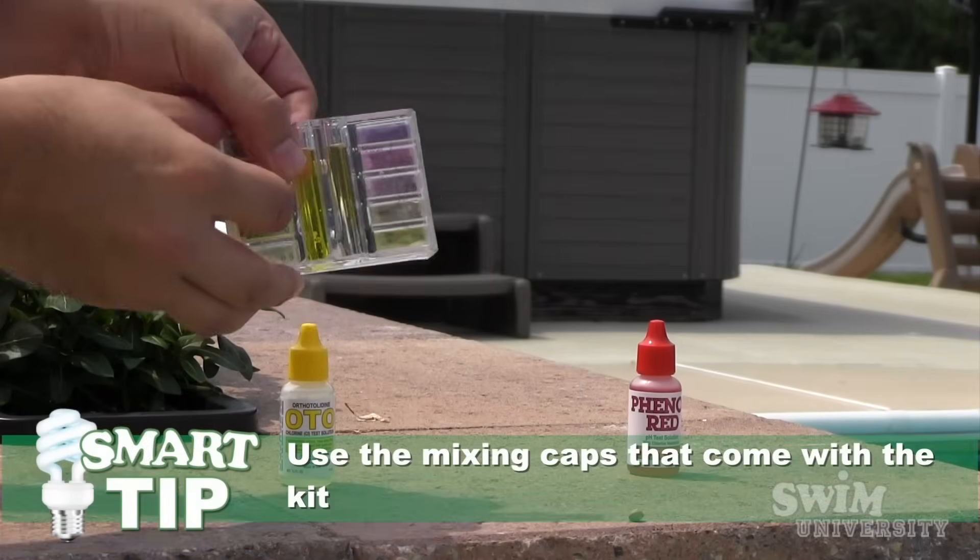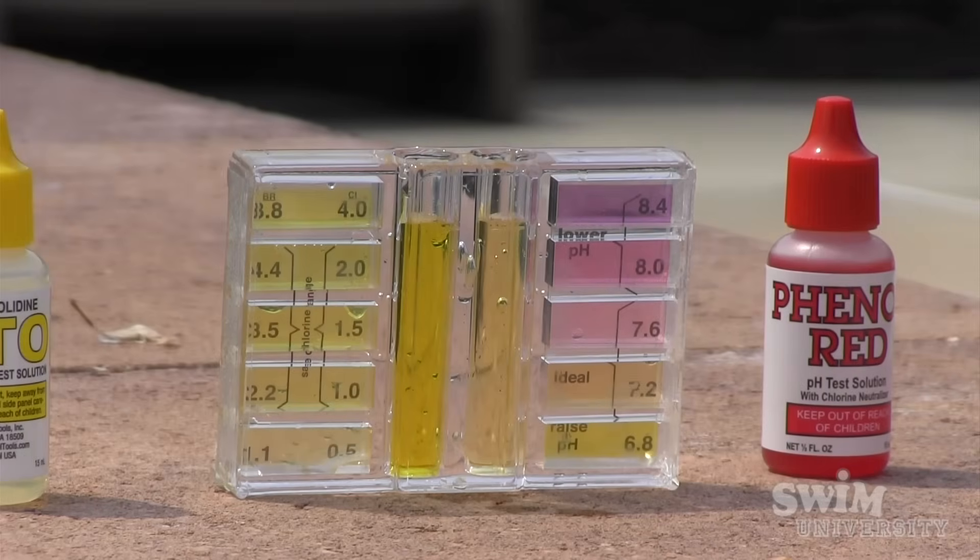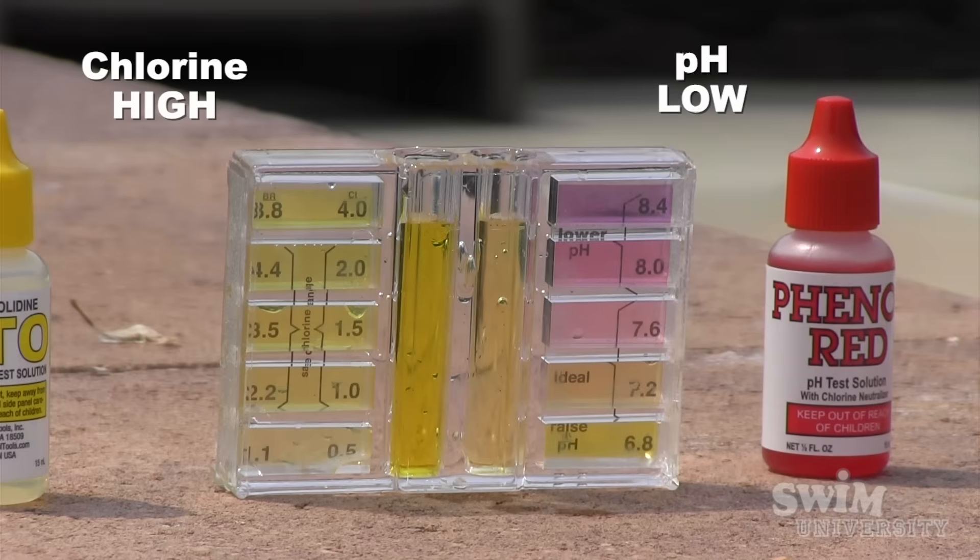Cover the opening and give it a good quick shake to mix it in the solution. You can now see the color difference compared to the sides of the container. It looks like our chlorine is high, but our pH is low.